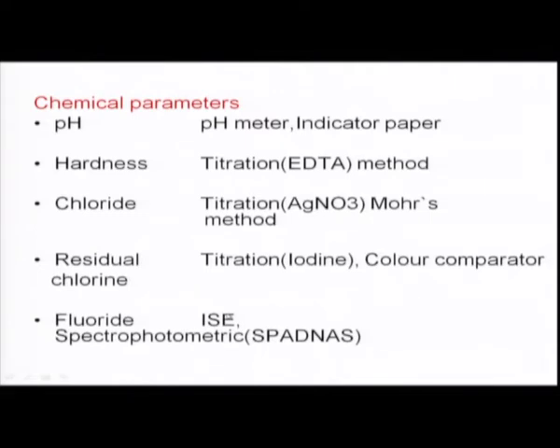That is a quick method again, and one of the very well established ion selective electrode methods for both pH and fluoride. A spectrophotometric colorimetric method is also available. Using the SPADNS method, we can measure the amount of fluoride, but here the spectrophotometric method based on the SPADNS reagent actually works in an inverse Beer's law manner.